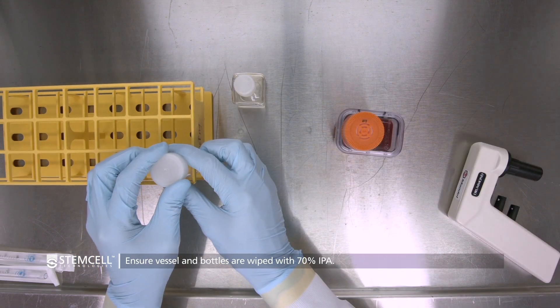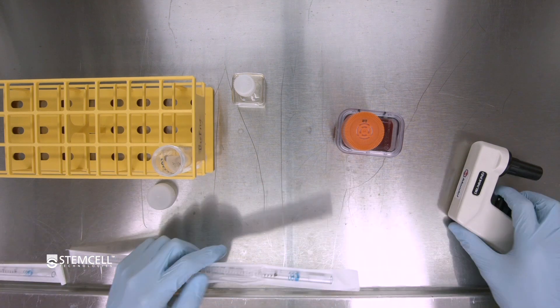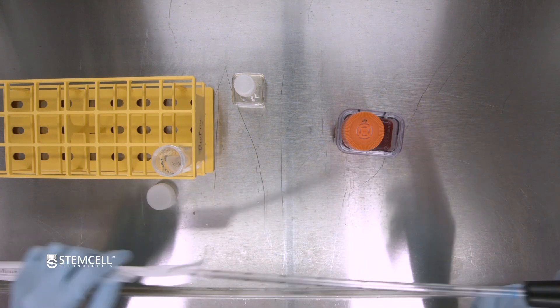The first step when feeding is to remove an amount of spent media equal to the volume you wish to feed. This will maintain consistent fluid dynamics throughout the vessel.